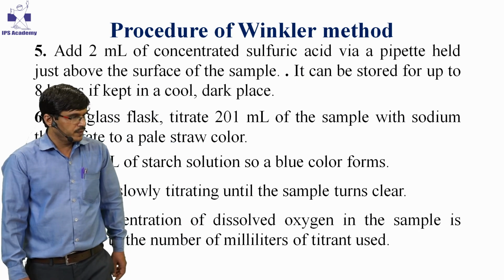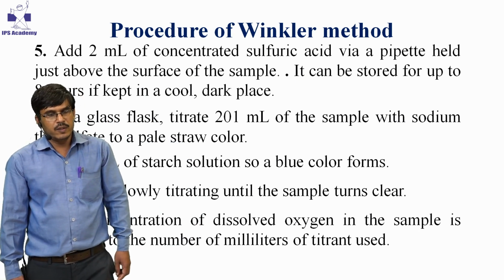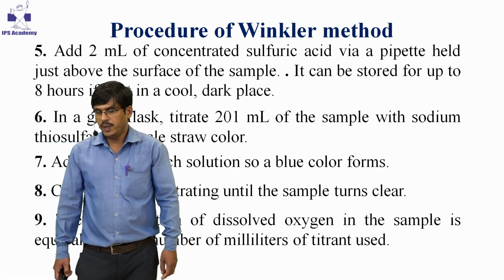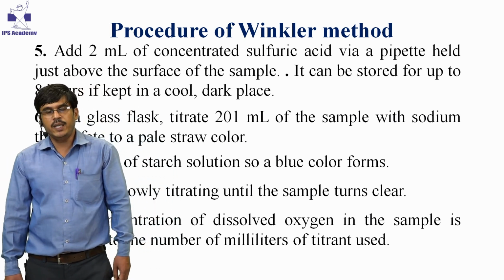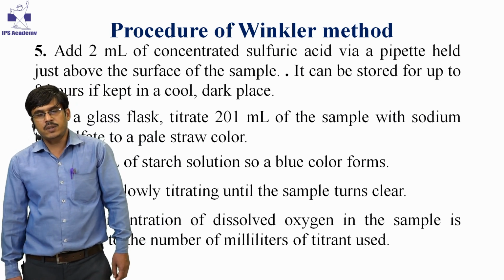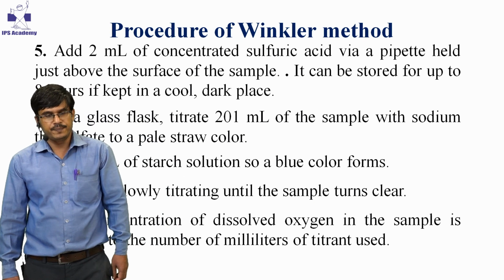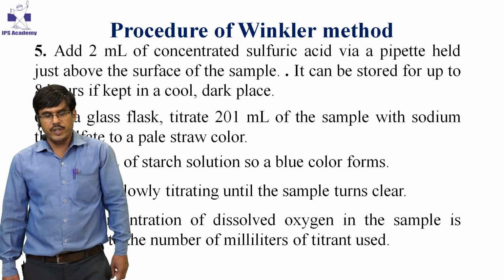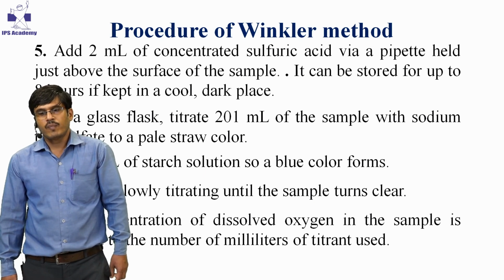Now we are going to our lab and practically we will determine the dissolved oxygen of a water sample that we have already collected from our nearby water body.